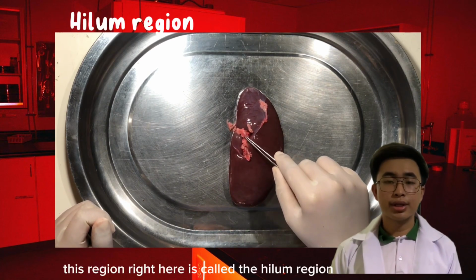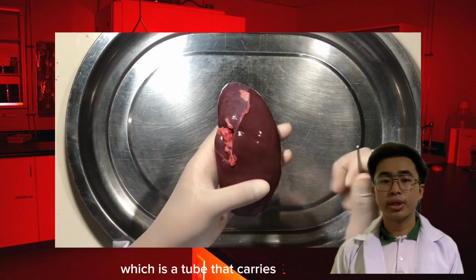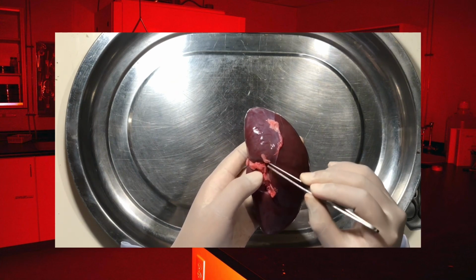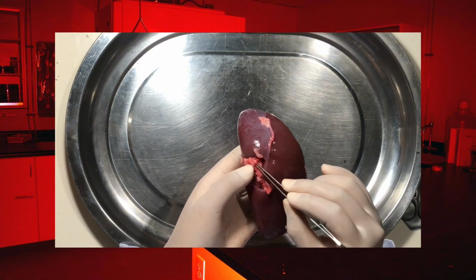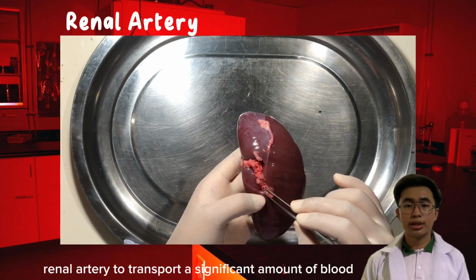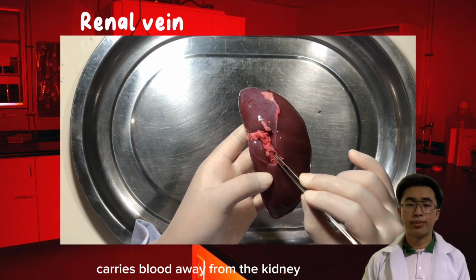This region right here is called the hilum region, which is the entry and exit point of the kidney for the ureter, which is a tube that carries urine from the kidney to the bladder. The renal artery transports a significant amount of blood from the heart to the kidneys, and the renal vein carries blood away from the kidney.